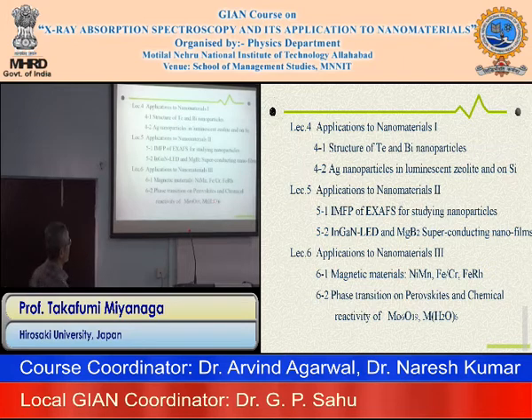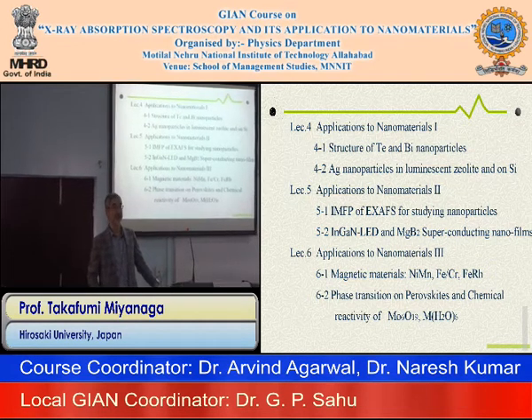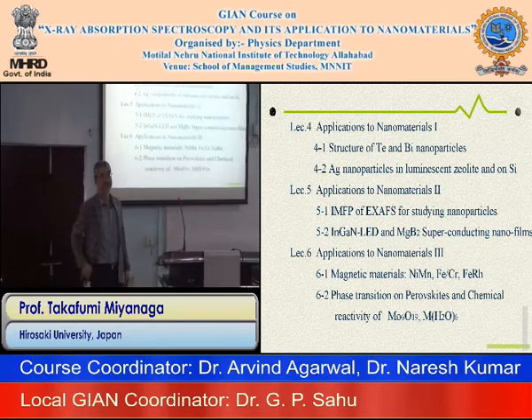So from the XAFS thermal analysis, we estimate the potential curve of the bond length, the chemical bond. I showed you how to obtain this type of potential curve. Okay, now I have finished my first talk on the application, the introduction of the physics of nanomaterials. If you have any questions or comments, please.